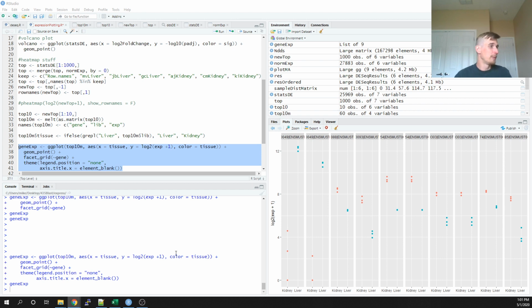And maybe not even these top 10 genes, but you may have a specific set of genes you're looking at. Some people may be involved in some ATP synthesis pathway and look at differential expression of those genes in different aerobic environments, in hypoxic conditions or something along those lines. This was just an example. Picking out the top 10 is the easiest, but others may be looking at specific genes within a pathway, pulling those out and comparing expression among tissues or among experimental treatments and things like that.